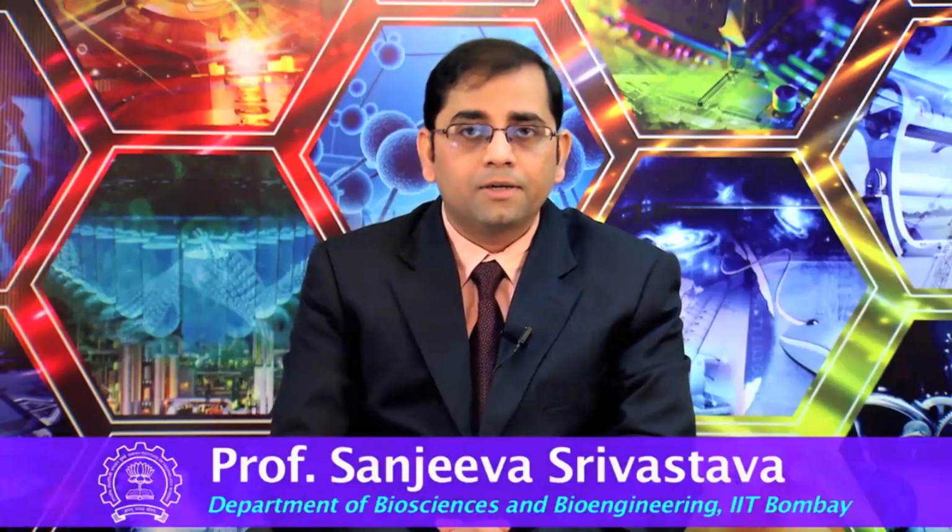Welcome to MOOC course on Introduction to Proteogenomics. In the last lecture, Dr. Mani provided you an overview of using ProTIGY software. Some of the features of ProTIGY include data normalization and filtering, data quality control checks, marker selection, interactive visualization of results, integration of protein-protein interaction databases, as well as how to save your analysis sessions and then share with your colleague researchers and collaborators. And finally, how to export your results into output files like Excel or PDF formats.